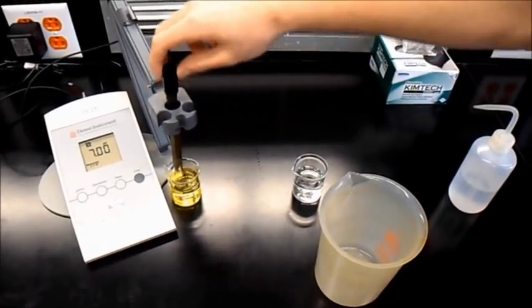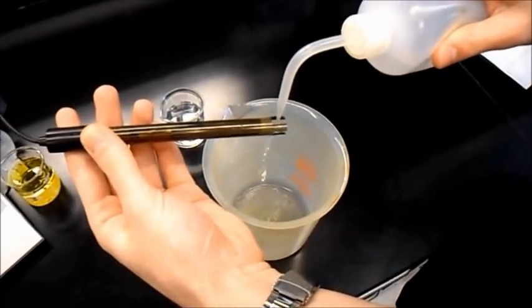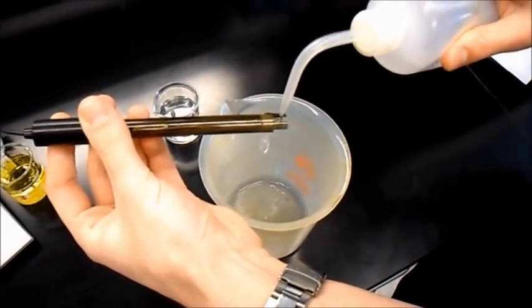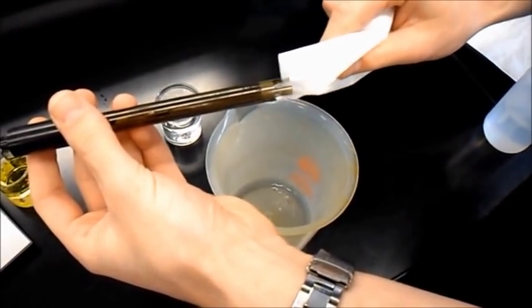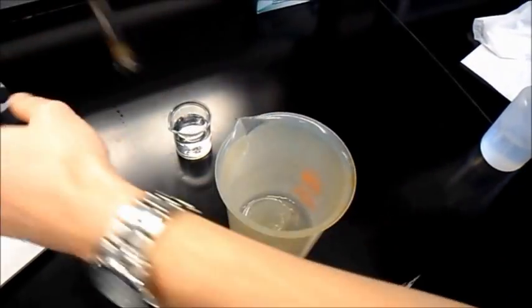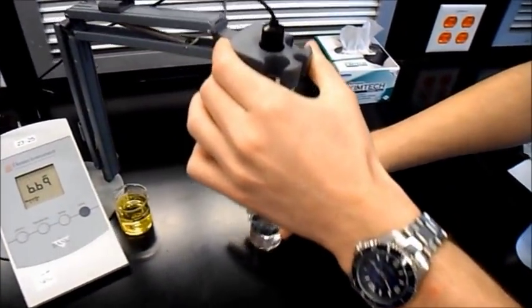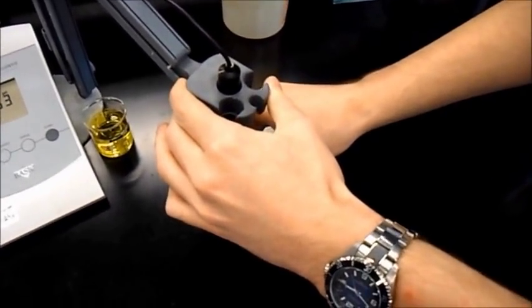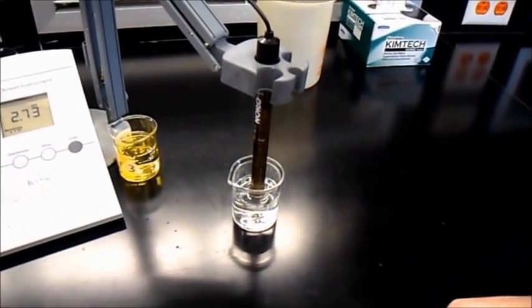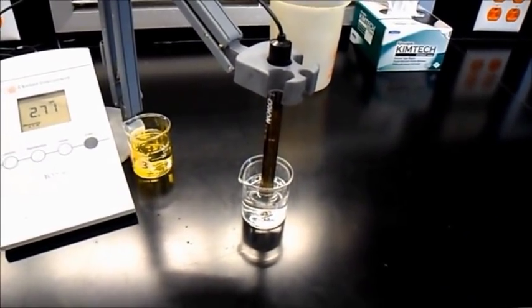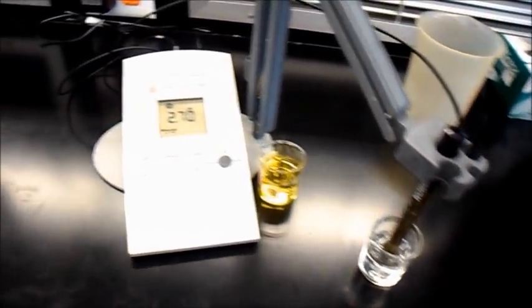To test a solution, rinse the probe and dab it dry. Then simply submerge the probe in the solution you want to test. When the reading is stabilized, a bold letter S will appear in the upper left corner of the screen.